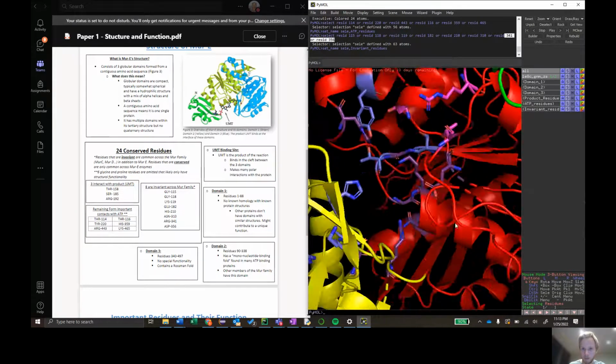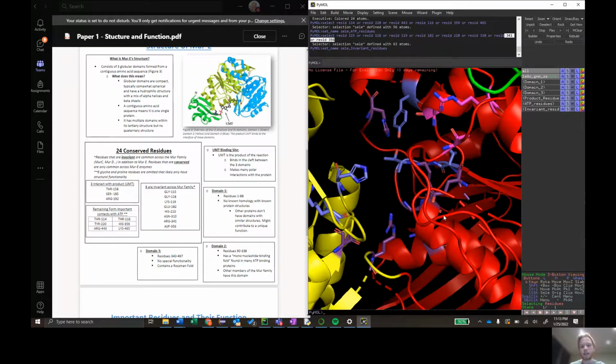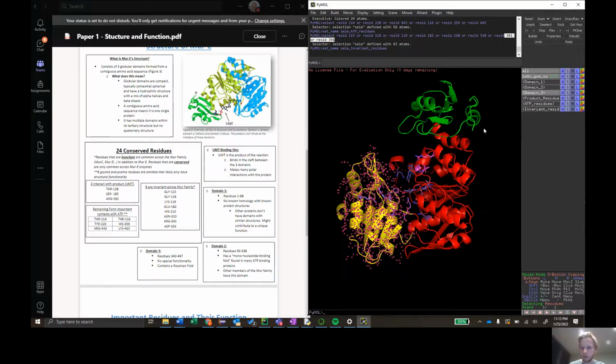It's a little hard to see, it's enough of a difference from the ATP binding residues, but in any case, you're more than welcome to choose different residues than mine, or at least different coloring schemes. So right now we've shown all three domains, 1, 2, and 3, and we've shown our different residues. Those are our main residue groups, so we're all good in this count.